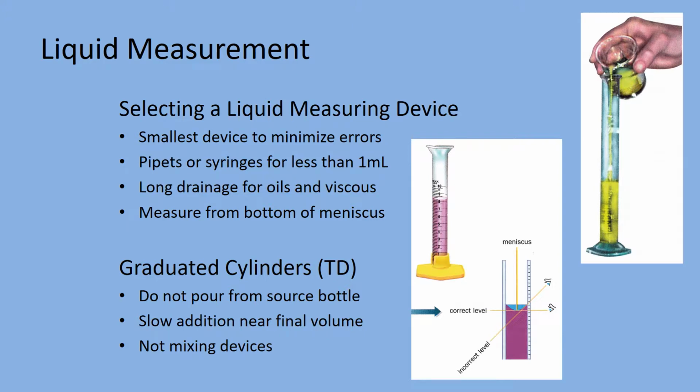When measuring with a graduated cylinder, most of the fluids will cling to the sides and create a meniscus. It's a moon shape, and to read accurately, you want to read at the bottom of the meniscus. So here at eye level, make sure you read the bottom. If you read from a different level, then it might register incorrectly.